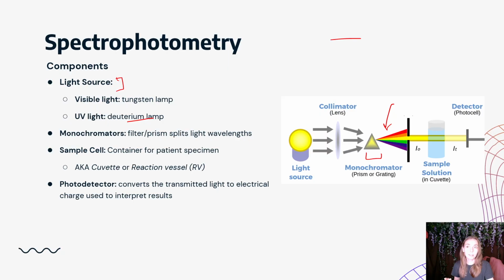We take the light and we break it up into all of those different bits, and then we say, I want that one. And then we filter the light so that only that one gets through. And then it passes through, and then we push it to the sample, and it hits the sample. Yay! That's what a monochromator does, okay?